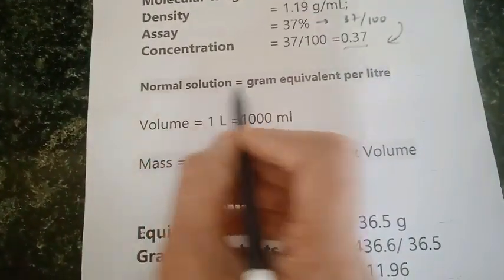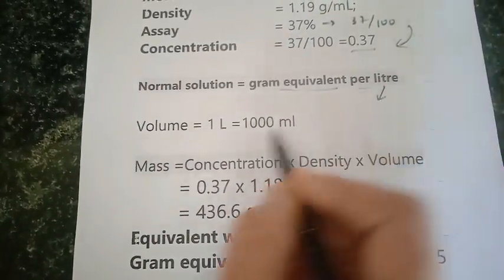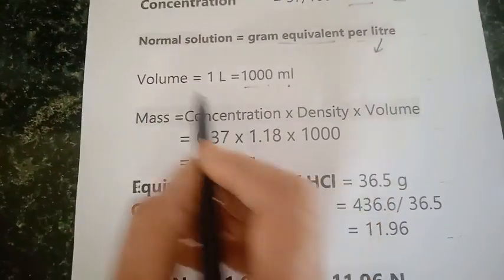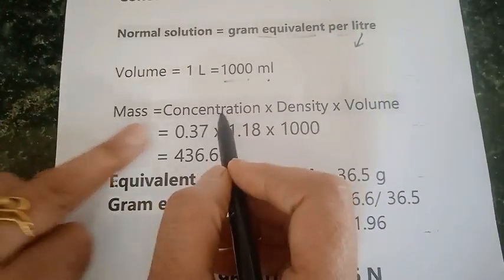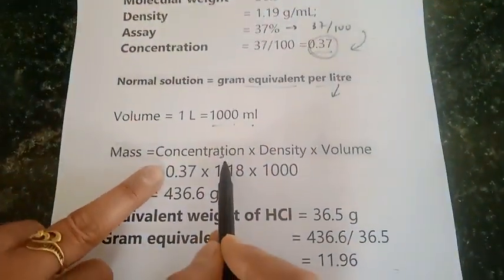So for that purpose we are going to calculate the normality and normality is gram equivalents per liter. One liter is equal to 1000 ml. So we are going to calculate the weight according to the 1000 ml of the solution.